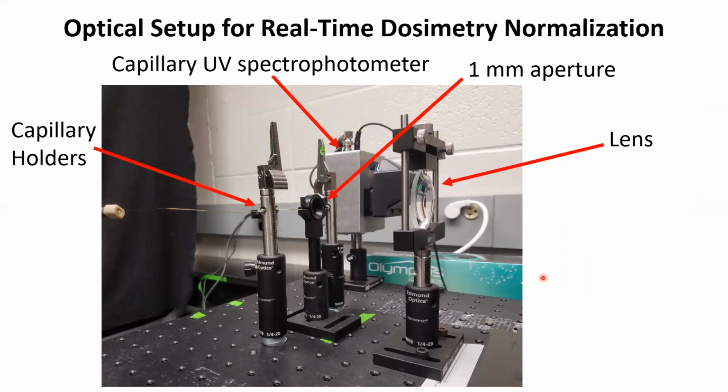So just to give you an idea from a practical standpoint, since this is a tutorial video, of how this works, how do you actually compensate in these experiments? This is a picture of our optical bench, which is a fairly simple example. There are simpler optical benches you can make, but this one is a relatively simple example that will work and allow you to do the experiments that we have pointed out here.